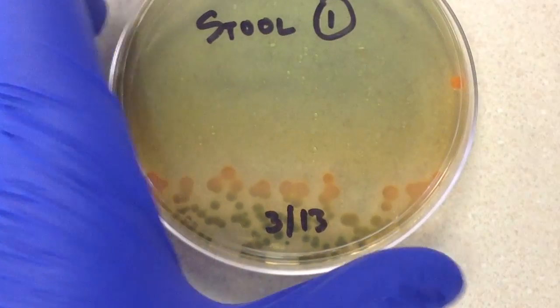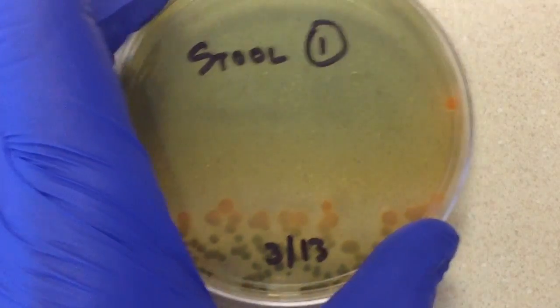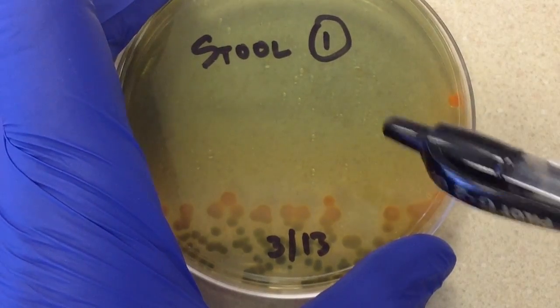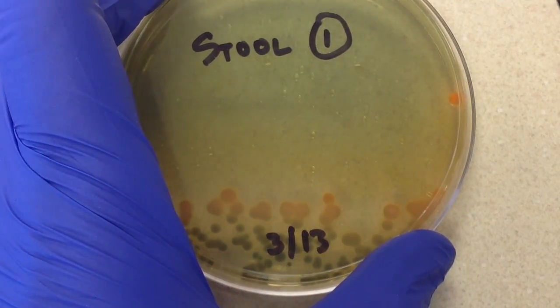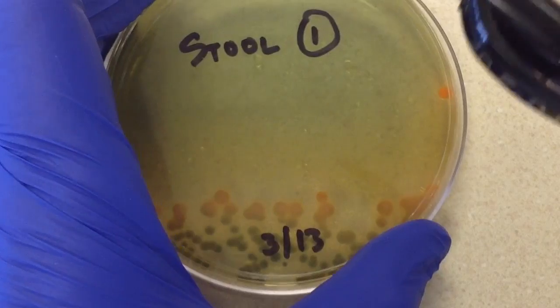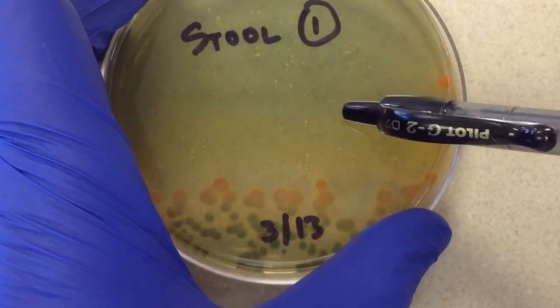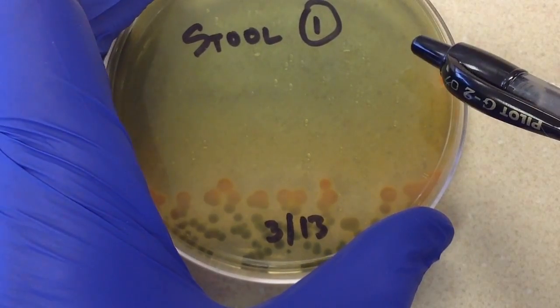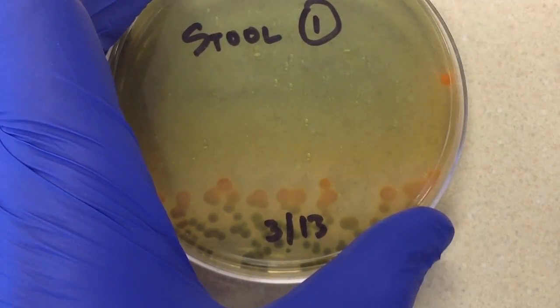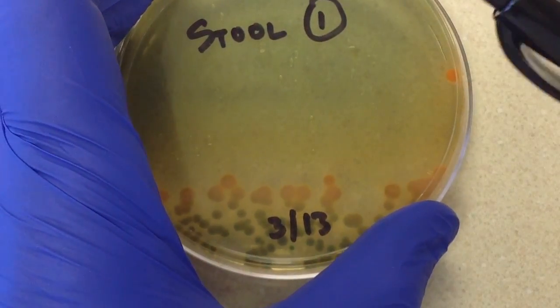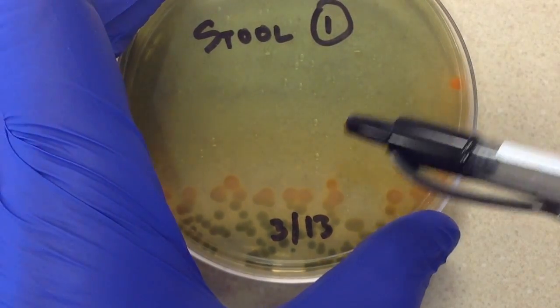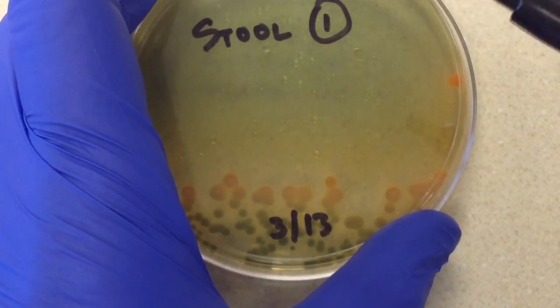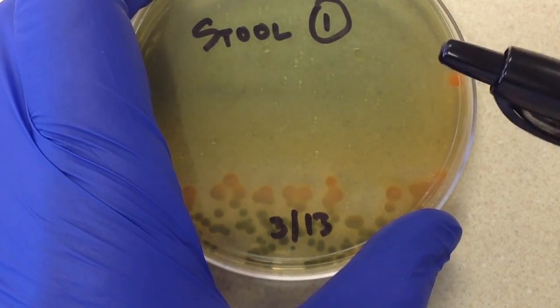Let's take a look at our hectone enteric or HE plate. This is also a selective differential plate. McConkey's is selective for gram negative, and this is as well. But this one is even more selective. This one is meant to get rid of the more coliform gram negative rods and allow Salmonella and Shigella to grow.